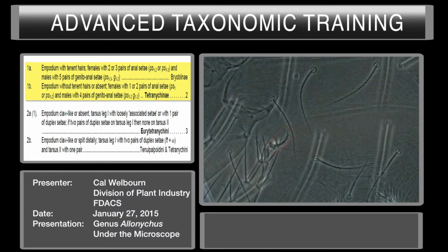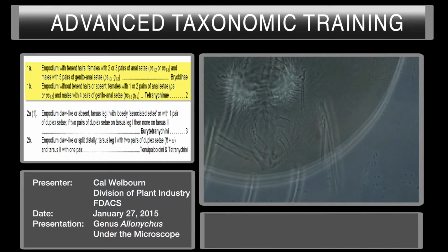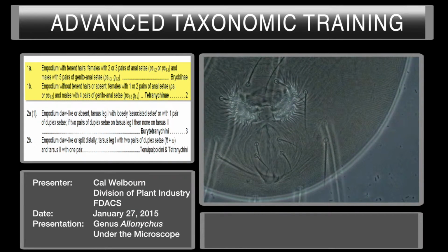Here's the empodium, and you see the structure coming off near the base with all the little hairs coming off of it. This is called proximal ventral hairs. They don't have tips on them. They're not tenent hairs. These are proximal ventral hairs. Now let's look at the genital region. Now we'll look at the genital region, and there should be 1 or 2 pairs of anal setae.